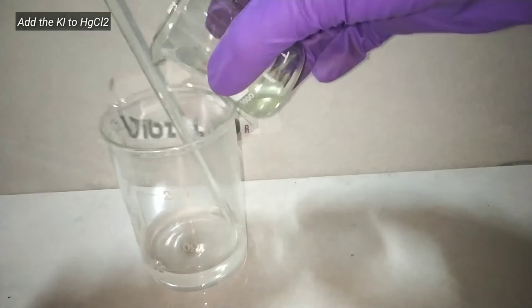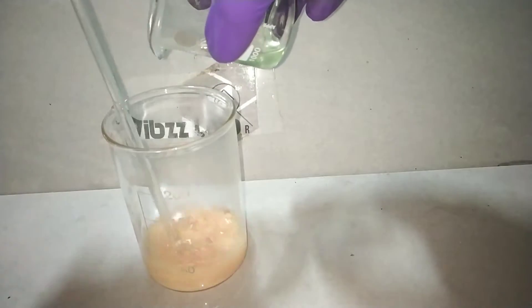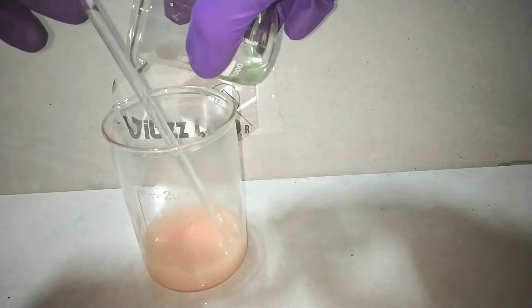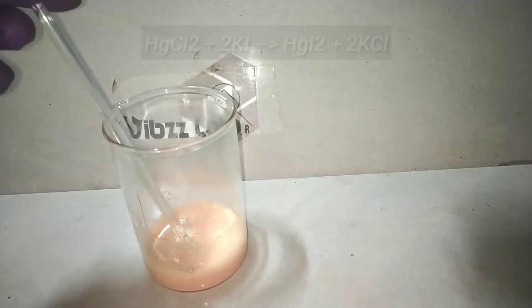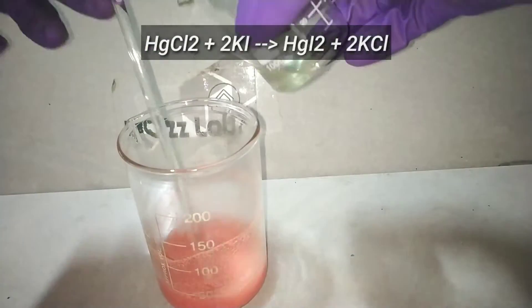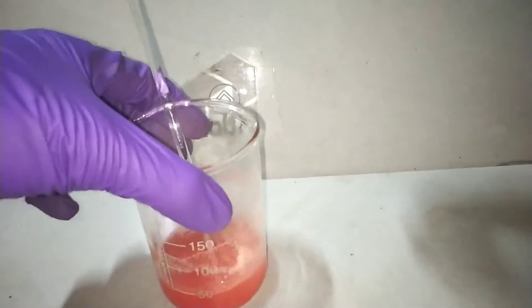Now we have all the solutions ready. First, the potassium iodide solution is slowly added into the mercury(II) chloride solution. You immediately see a red colored precipitate being formed — this is mercury(II) iodide. Continue adding the potassium iodide and you will notice the color of the precipitate becomes darker and darker as more mercury(II) iodide forms.